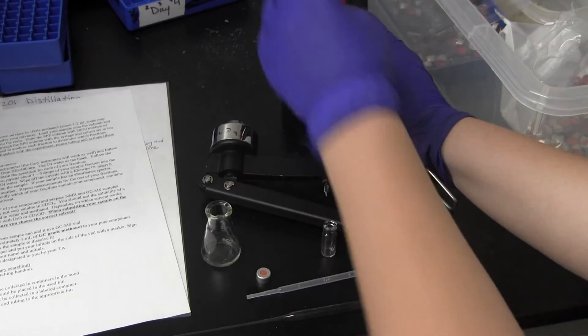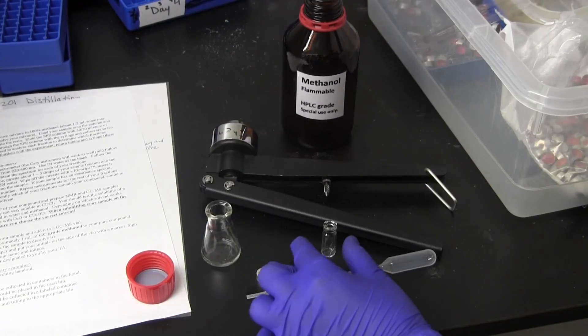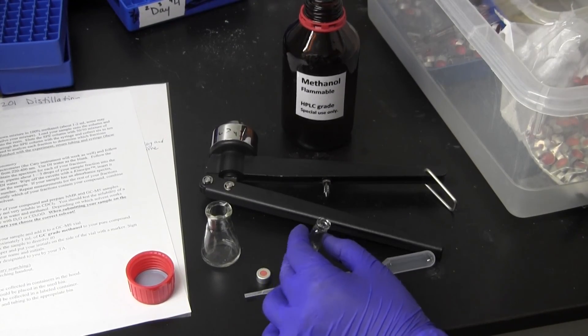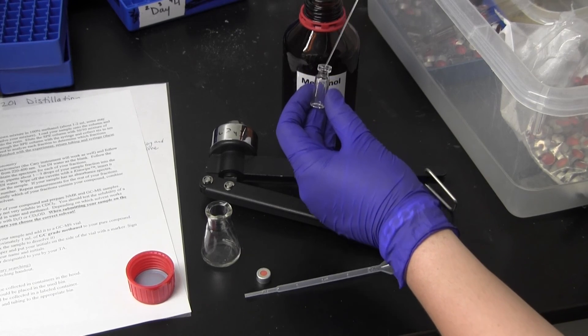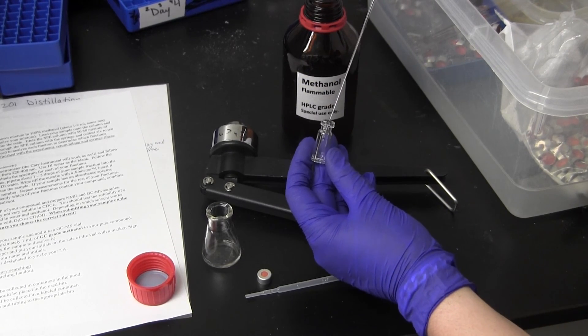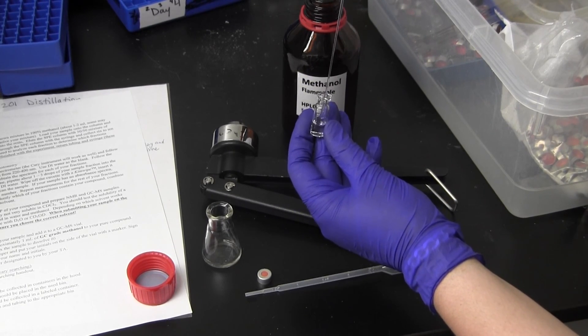Then use 2 or 3 drops from your NMR tube to submit a GC-MS sample. Remember to use regular methanol to dilute the GC-MS sample. Do not use deuterated methanol.